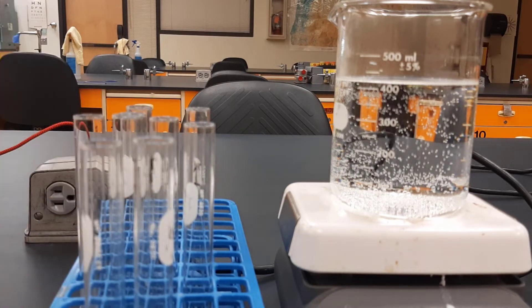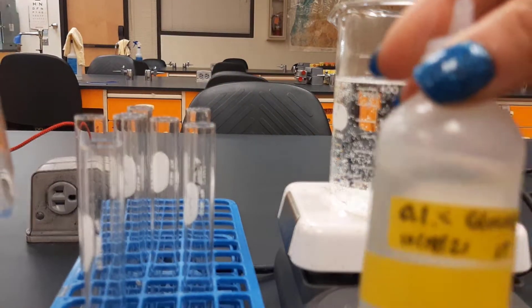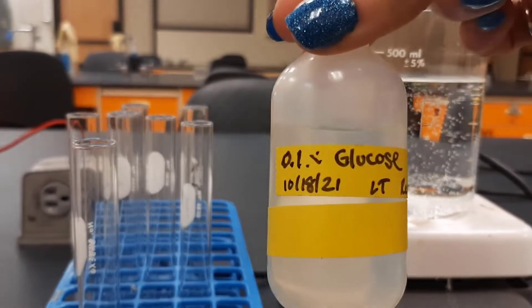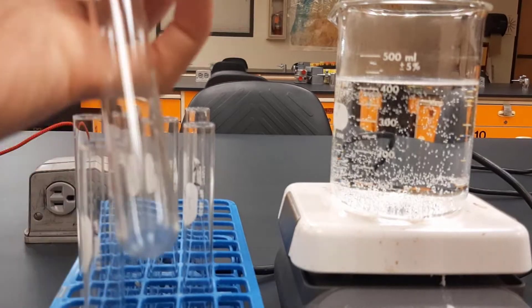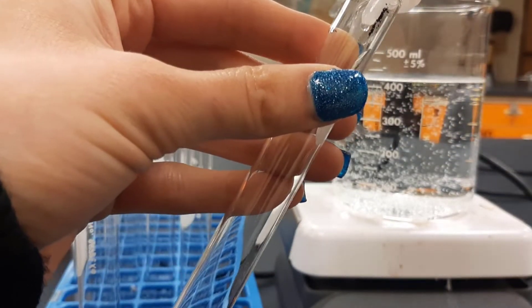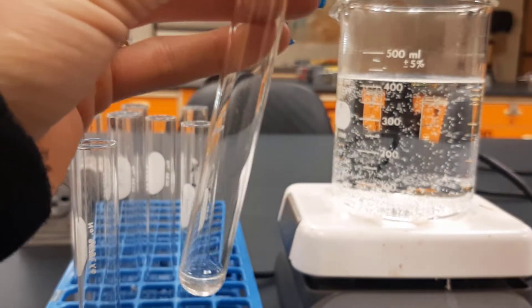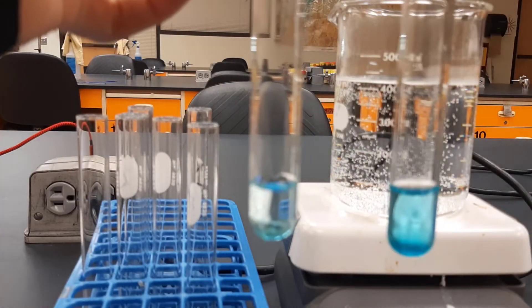And then our positive control — we are going to put in some glucose. There we go, 1% glucose. Put in the glucose, that doesn't take much, and then again a few drops of Benedict's. All right, positive and negative controls are set.